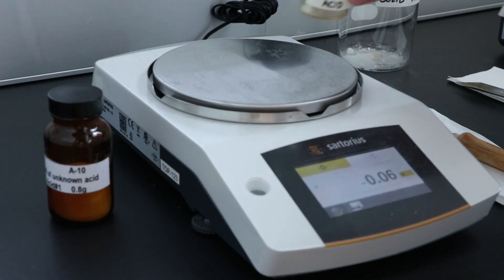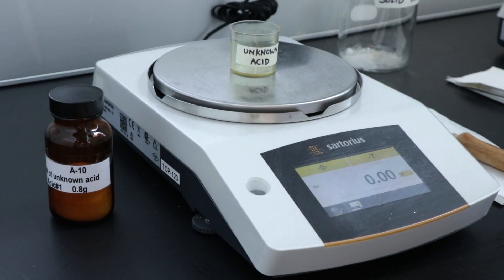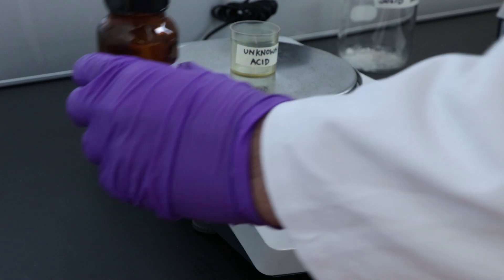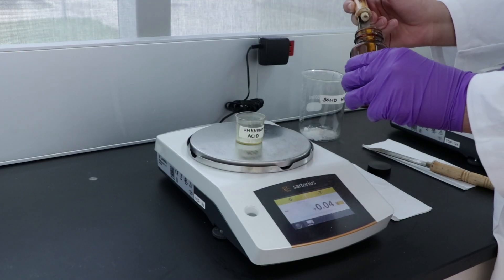First, in order to prepare the standard solution, weigh by difference the appropriate amount of unknown acid as indicated on the acid bottle. Remember to tare the top loading balance before adding any acid to the weighing bottle.